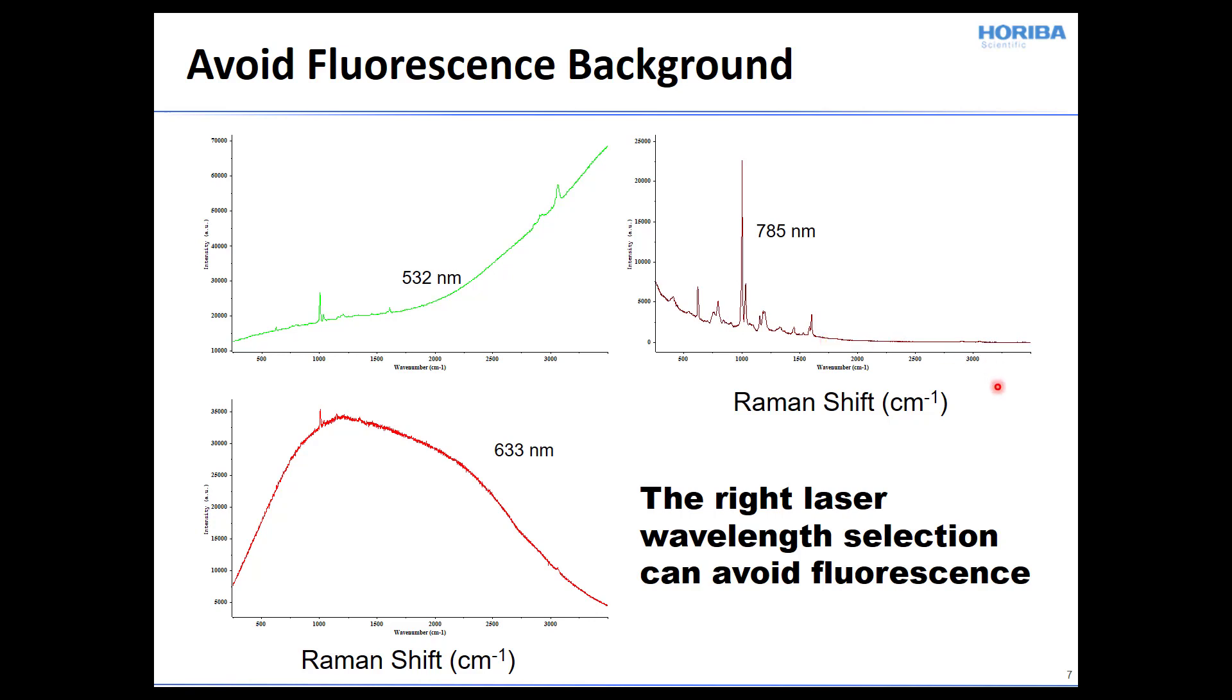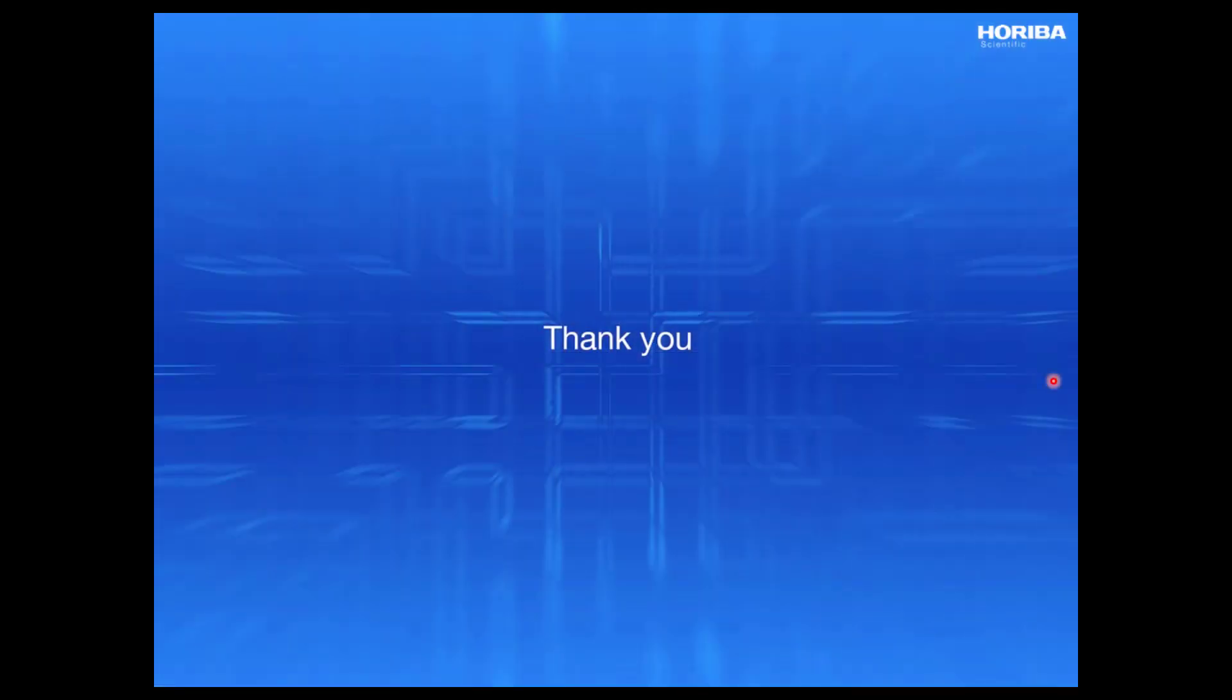So the point here is that the right laser wavelength selection is key to avoiding fluorescence. And so I hope that with our discussion today, you have a better idea of the problem of fluorescence in Raman spectroscopy, and one way to avoid that is through the proper selection of the excitation wavelength. Thanks.